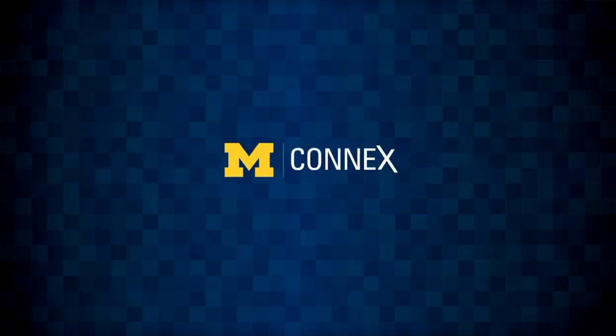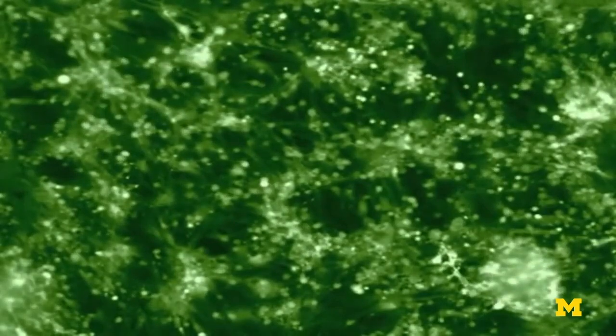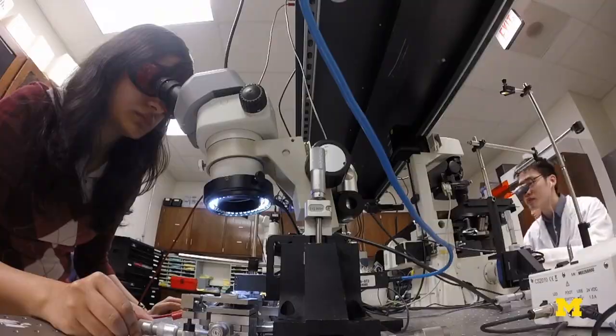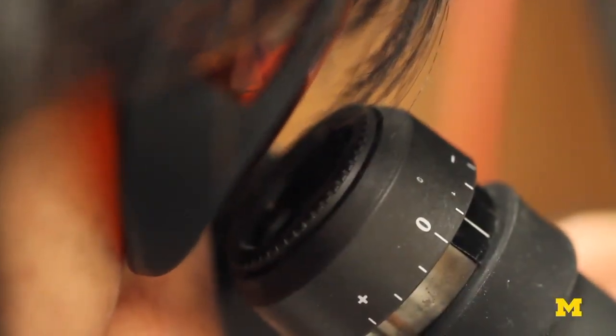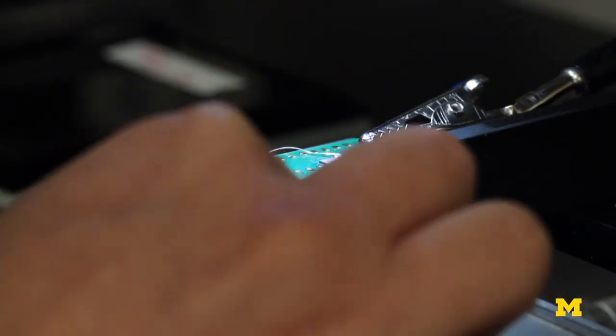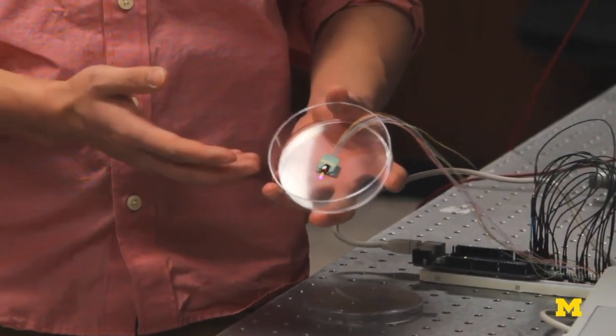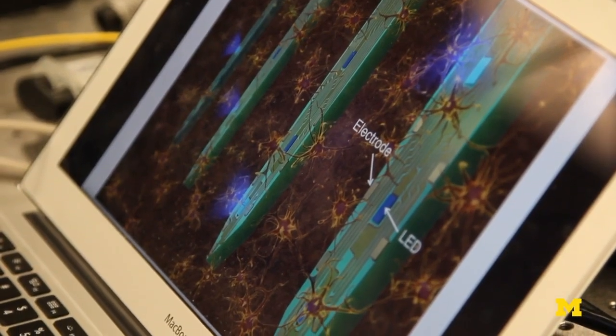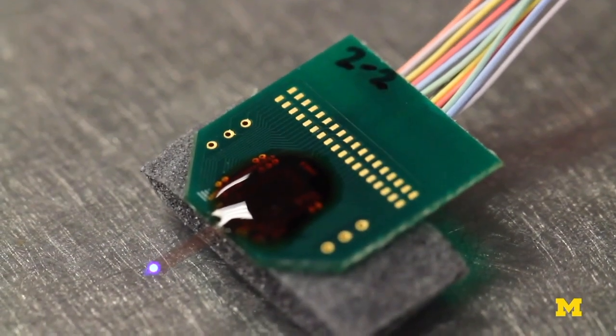We know very little about this neural network. However, with optogenetics, you can genetically modify neurons so that specific target cells only respond to a wavelength, different colors. So we are developing the next generation probe, recording signals electrically, but also providing optical stimulation on the same chip. We have 12 LEDs patterned at the tip of 4 penetrating silicon shanks, and I can control the timing of these 12 LEDs to stimulate different parts of the neural circuit.